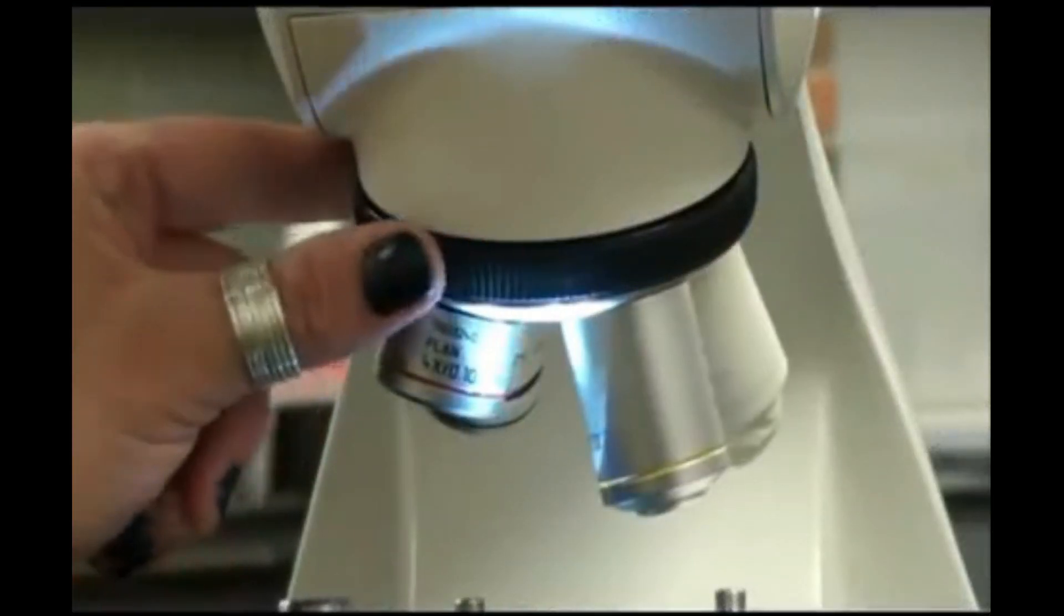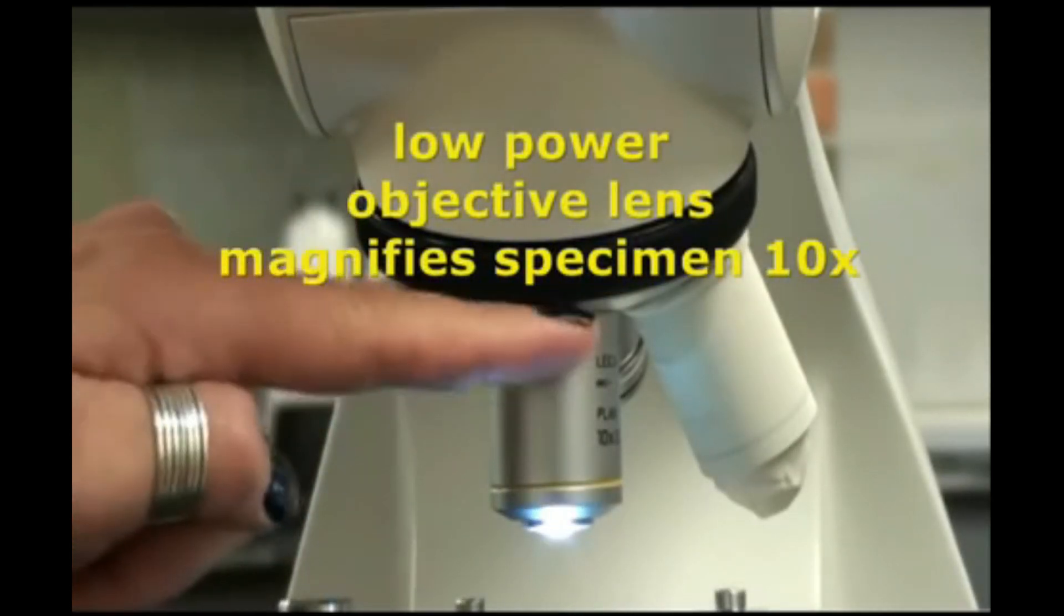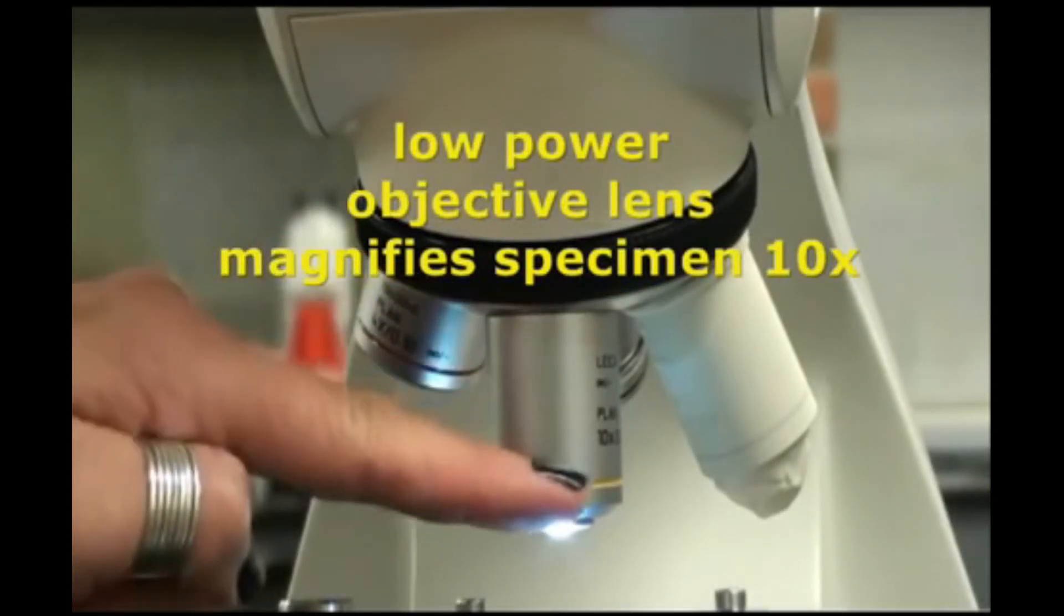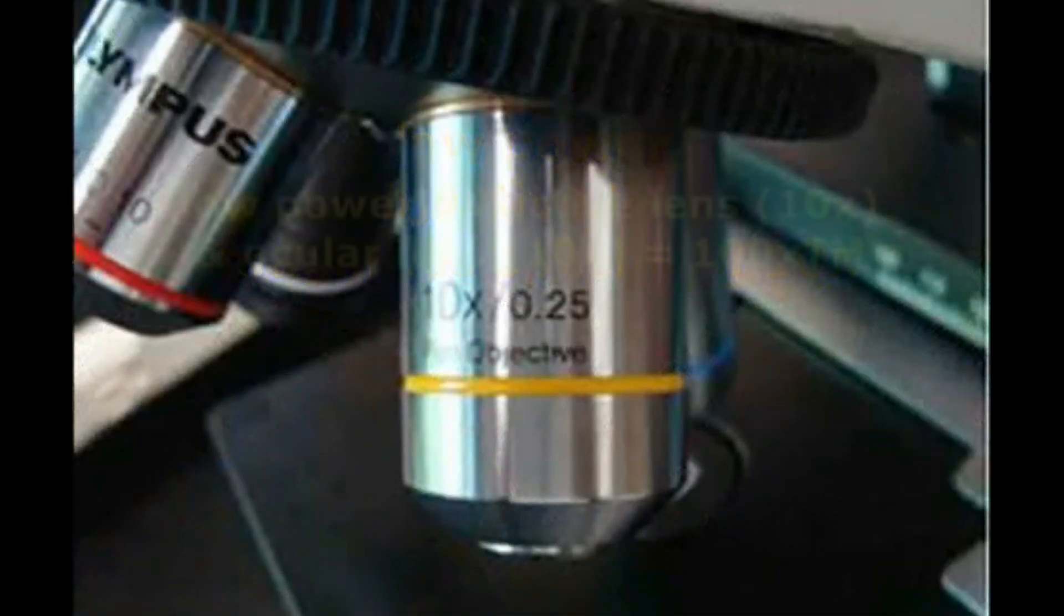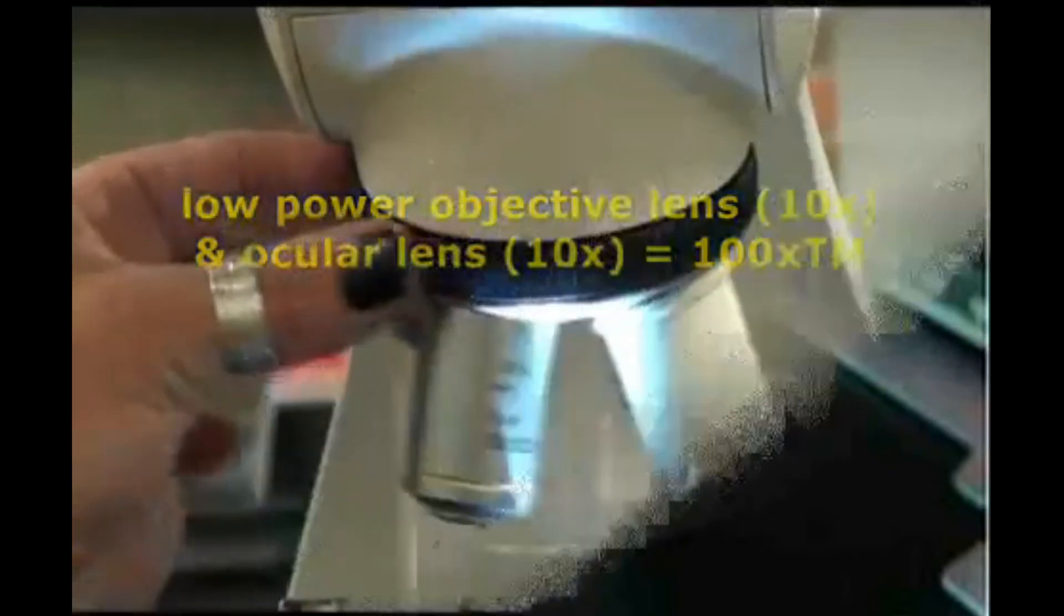The next objective lens is the low power lens. It has a yellow band around it and it magnifies objects ten times actual size. So the total magnification when using my low power lens is the ocular, which is ten times, for a total magnification of one hundred times actual size.